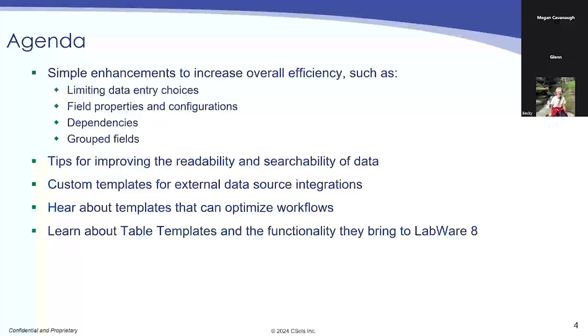Hear about templates and how that optimizes your workflows, guiding users on data entry for those redundant fields, and automation of selections through specific criteria. And then we'll talk about table templates and the functionality that they bring to LabWare 8.